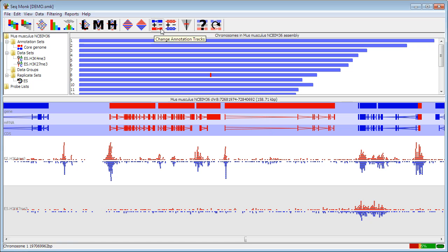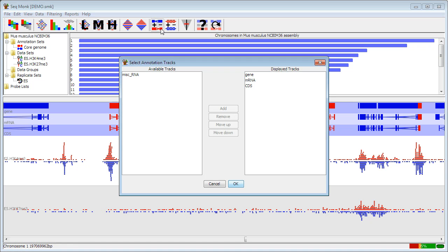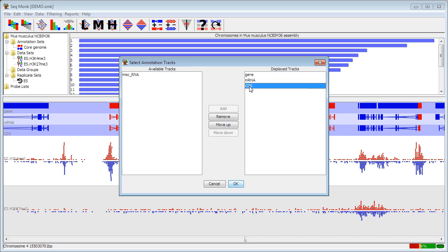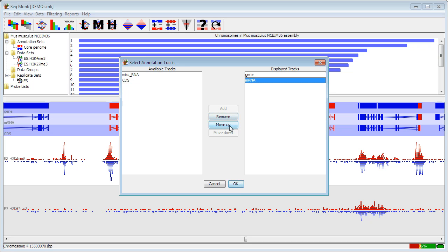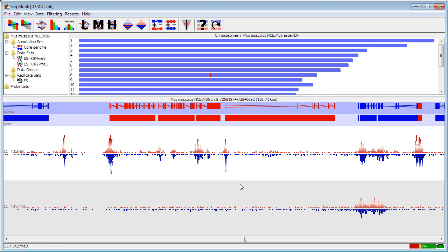This one allows you to change the annotation tracks. In this case this is quite an old assembly so I don't have very many annotation tracks, but newer assemblies you'll see more options for which tracks you want to display. So if I wanted to remove my coding sequence track I can click on that and press remove. And if I wanted to put my mRNA track at the top I can just move that up. And when I say OK the tracks will reorganize themselves.